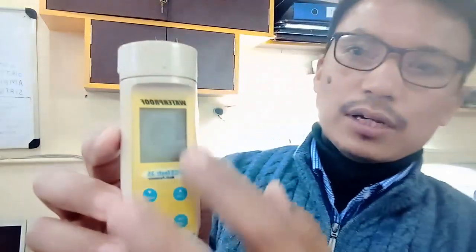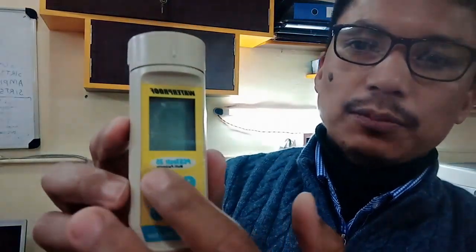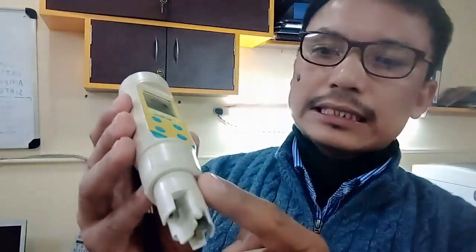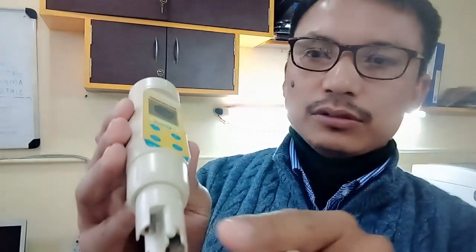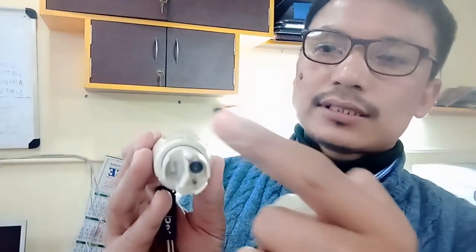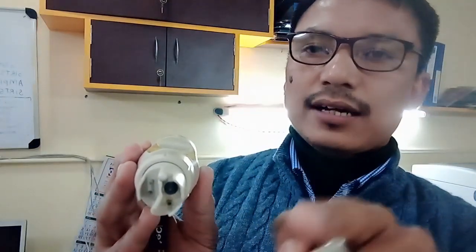Here you can see one of the display windows, and there are some buttons. This is the start button, the calibration button, these buttons are there, and you can see this is a probe. This is called the probe. This is inserted deep into the water, and there are some sensors. These sensors can easily get the desired parameter.